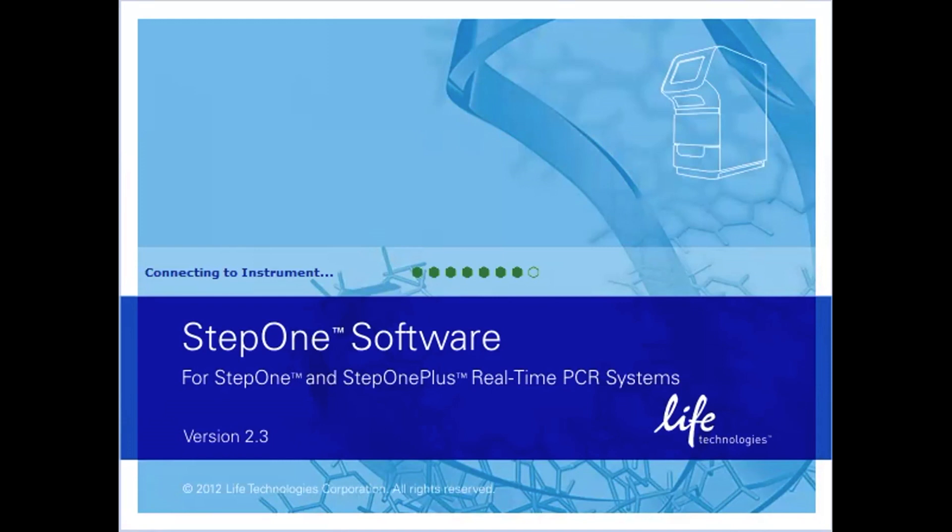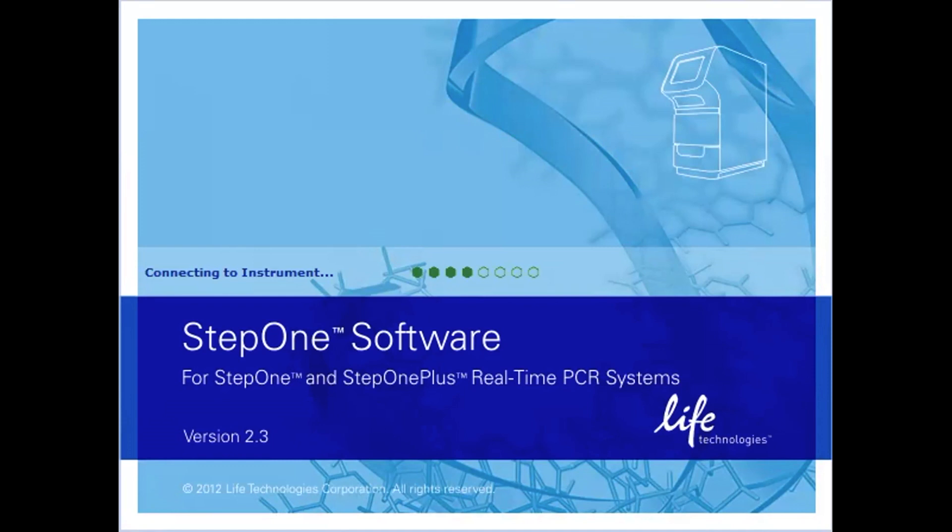The software might be slightly different if you're using a more current instrument, so please adjust as needed. This video includes the assignment of DNA standards as 10-fold serial dilutions for absolute quantitation of target DNA in unknown samples. The plate setup includes 39 samples in duplicate and 5 standards and non-template controls in triplicate in a 96-well plate.